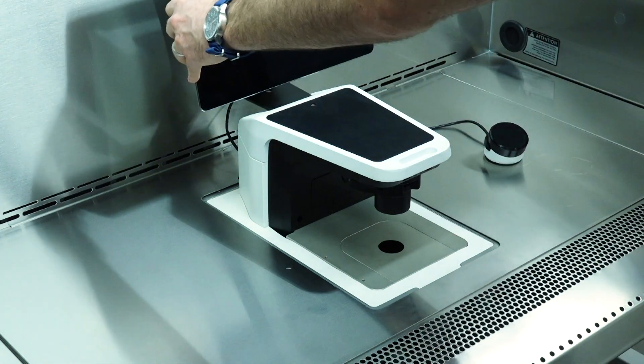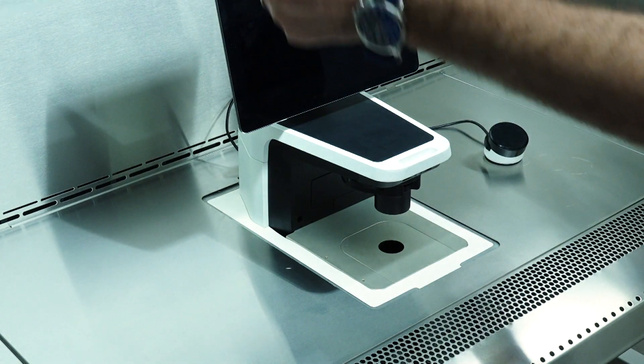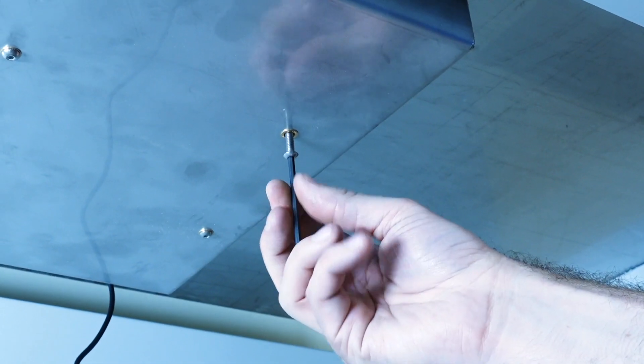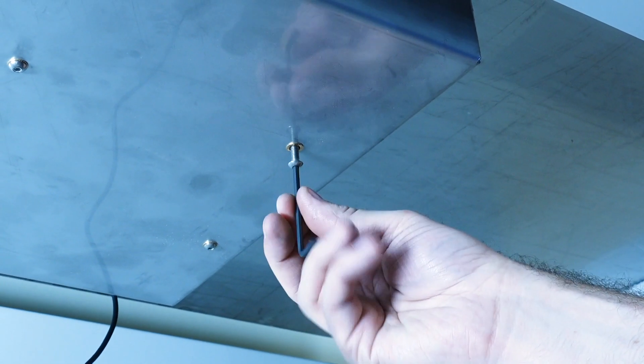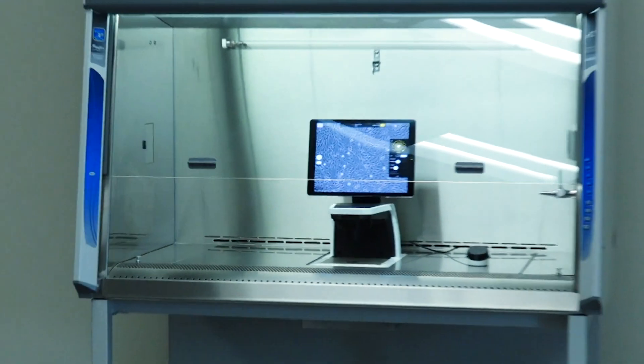If necessary, level the microscope stage to the BSC work surface using the microscope adjustment screws located underneath the biosafety cabinet on the bottom of the sump. You've just completed installing your Rebel Logic Plus biosafety cabinet.